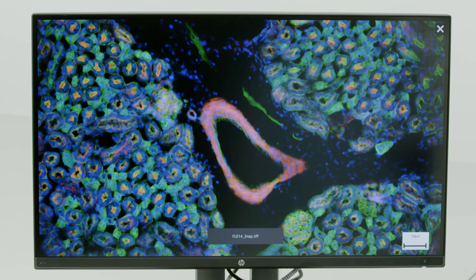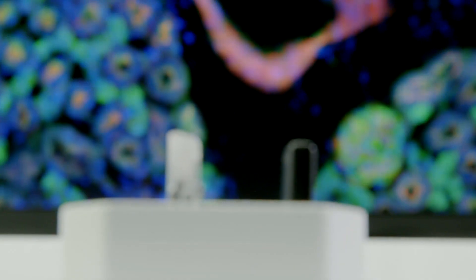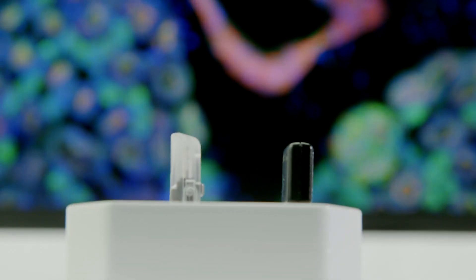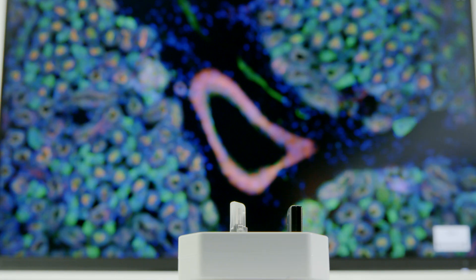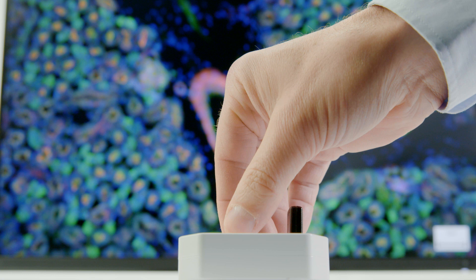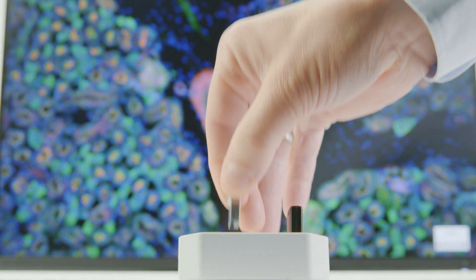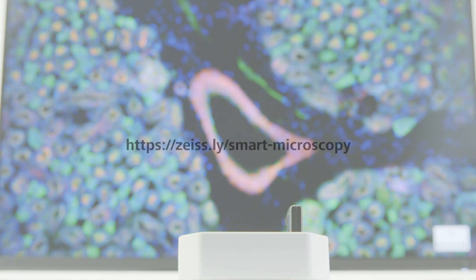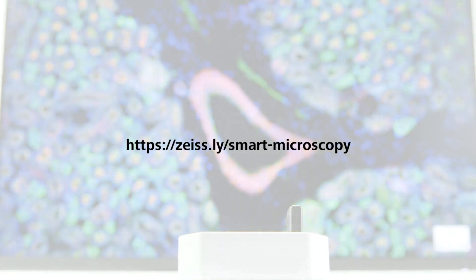There you have it — your overlaid multi-channel fluorescent image, including scale bar, is now ready and waiting on your USB stick. For further information, visit our website.